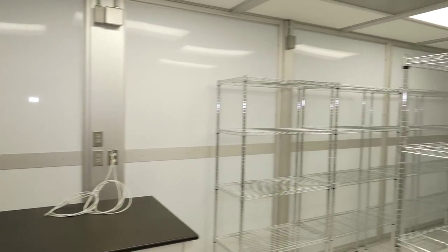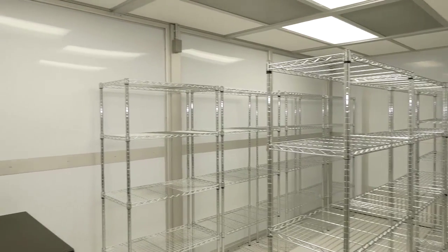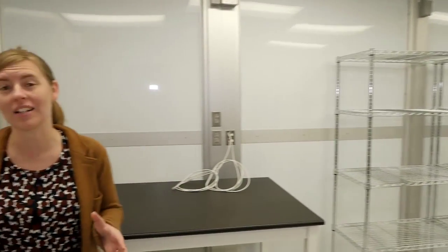I'm so excited to give you a sneak peek of what is to come. Now, normally in this laboratory, we require specialized protective clothing, not to protect us from the materials, but to protect our ancient precious materials from ourselves, from the DNA on our own bodies. But since this laboratory is still under construction, we can go ahead and come through in our street clothes because it hasn't been fully sterilized yet.